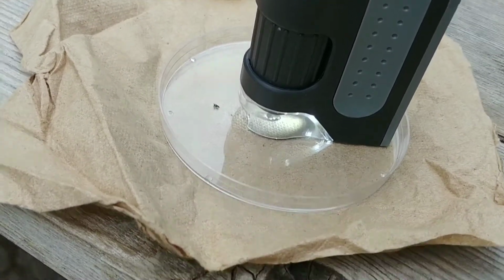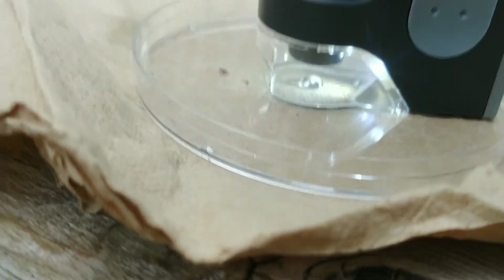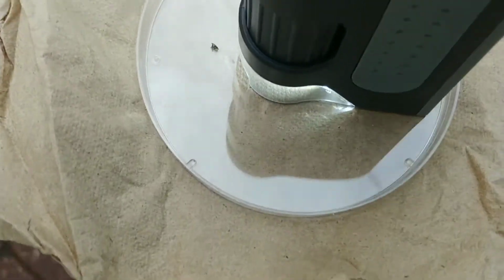I'm just gonna clean off the camera. And so I took that same water sample and I just put it, you can see it right there actually, and I adjusted everything. And you should be able to see at least one. Alright, this might take a while to figure out. You should see a microbe in there.